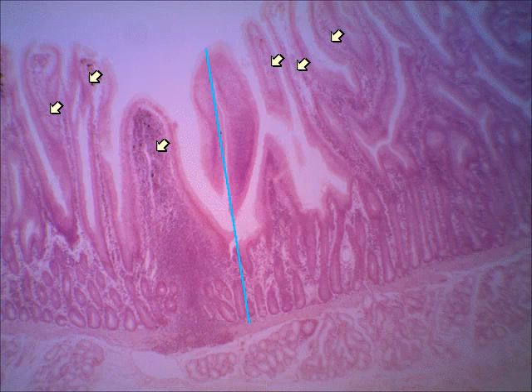And then in the submucosa, you see some glands that look a lot like those mucus glands in the submucosa of the esophagus, because they are mucus glands, but these have a special name. They're called Brunner's glands. So you'll see that in the other written descriptions that I've got for you in the folders on these slides. But you see the Brunner's glands there. Deep in the mucosa, you also see some little glands that would be analogous to the gastric glands in the stomach.